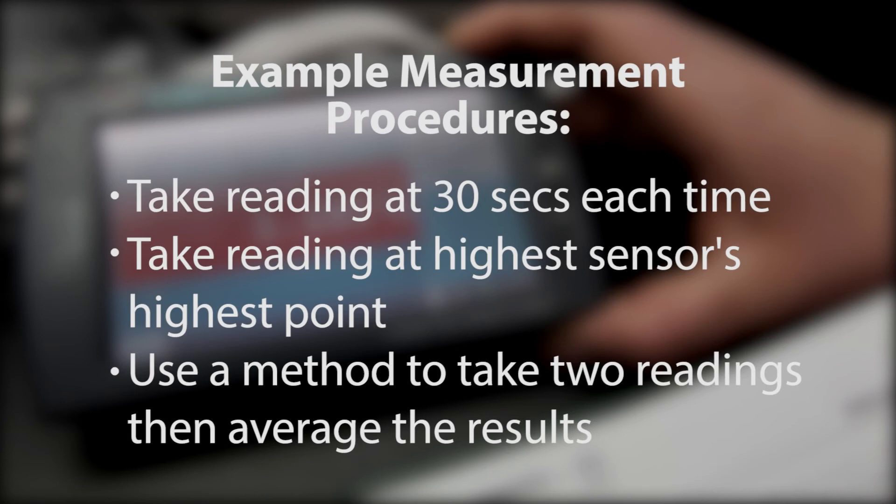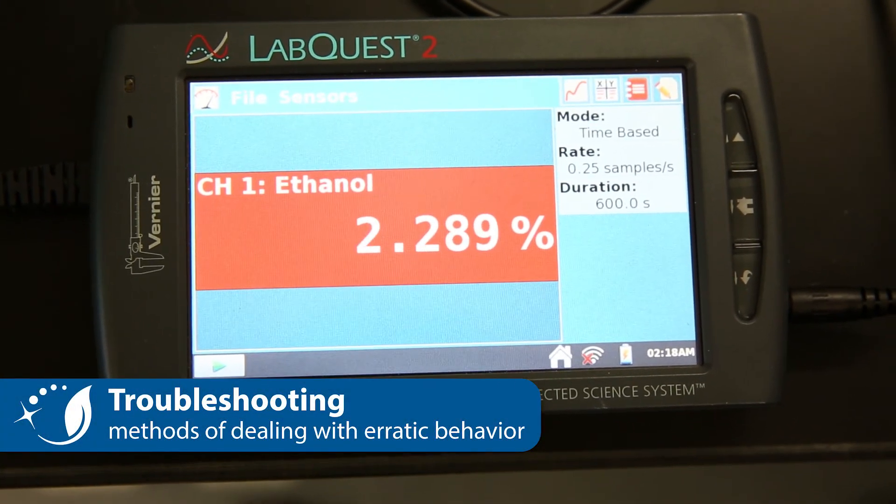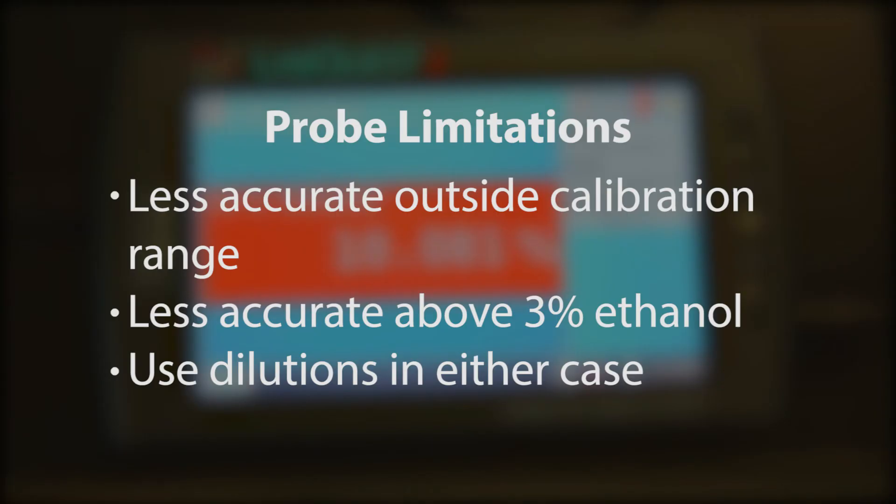If the probe starts producing erratic results, try recalibrating and measuring again. The sensors are only accurate up to three percent. If possible, use dilutions to take more accurate measurements for higher ethanol concentrations.